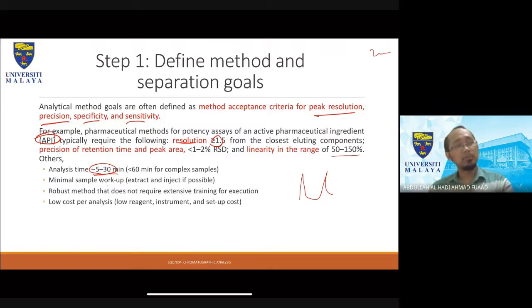Say, for example, if you have a sample from a river, you know what you want to analyze, and the only sample prep that you need to do is filter it through a 0.1 micrometer filter. Okay, an example. It's a very simple workup. If you do that, you'll be able to analyze, I'm not sure what you can analyze, perhaps a VOC or metal concentration, for example. Okay, so the shortest, the better, the easiest, the best.